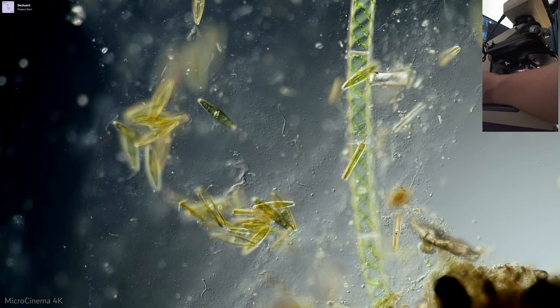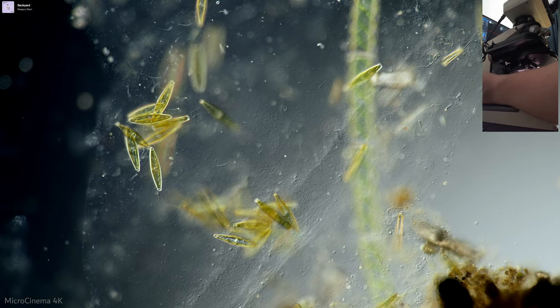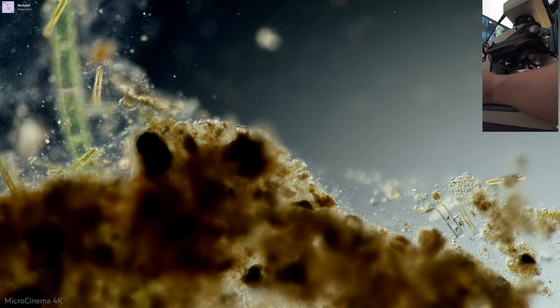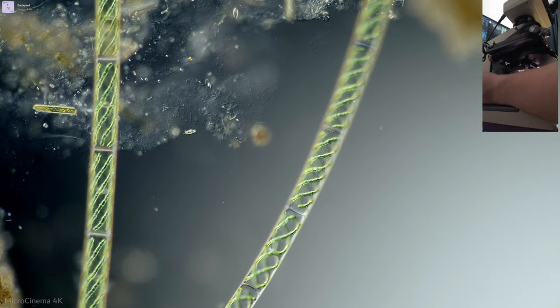In fact, sometimes I kind of like how it looks. Just look at these wonderful diatoms. I think these are all Starnies and they're just beautiful. Everything here is beautiful in DIC.